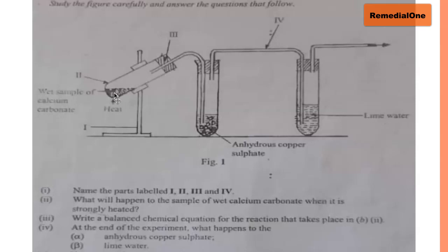So that's the first thing. Then when you continue to heat the sample after it has lost the water, the calcium carbonate will decompose, or break down, to give us calcium oxide and carbon(IV) oxide.